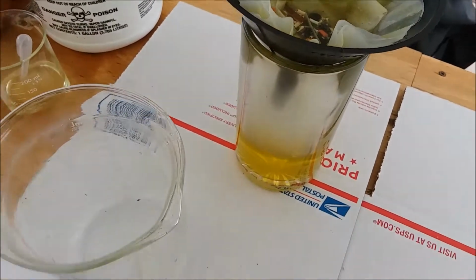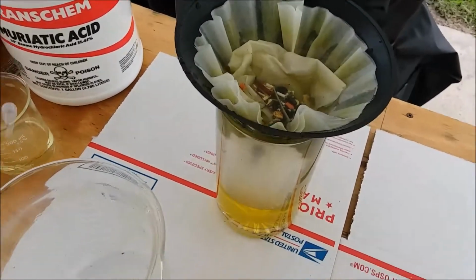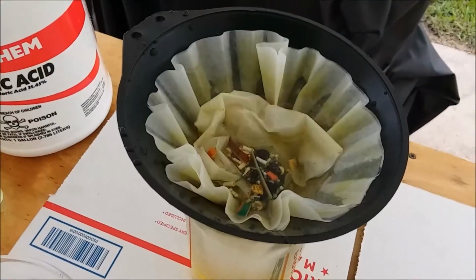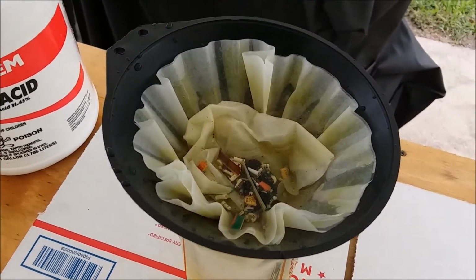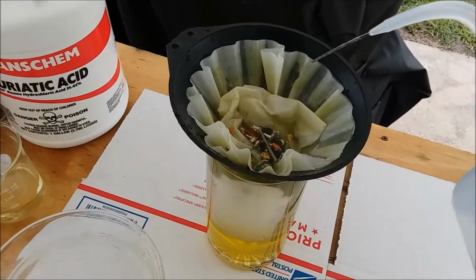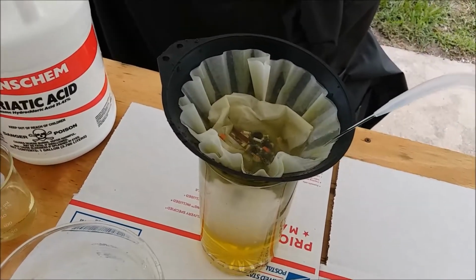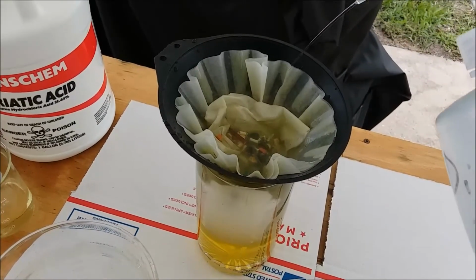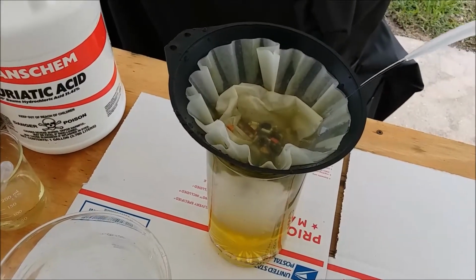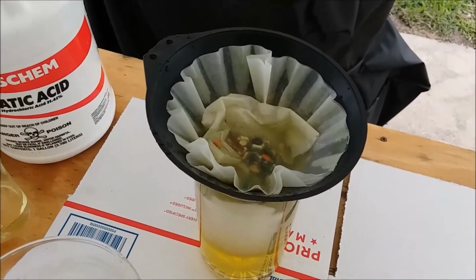Okay, I did it off camera just because, again, I don't have the camera on a tripod, so I rinsed everything out of this beaker with distilled water into the funnel here, into the filter, including the old filter. And what I'm going to do is continue rinsing this with distilled water until I get all the yellow color out of it. Because that yellow color, that's chloroauric acid. That's basically gold in solution. So do a lot of rinsing here. Give it a couple rinses, let it all filter through.